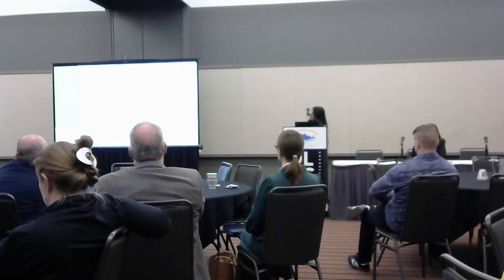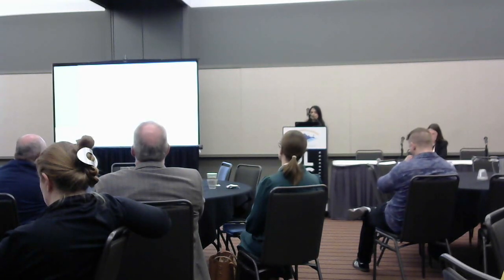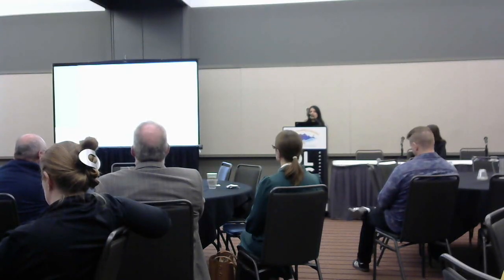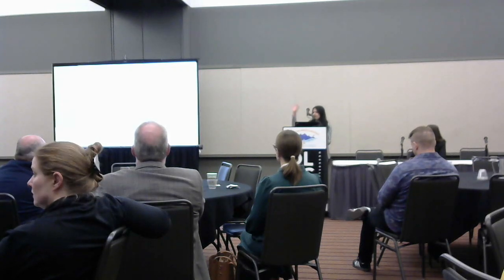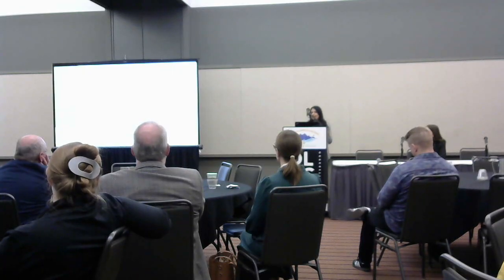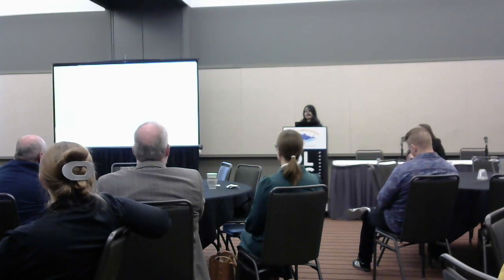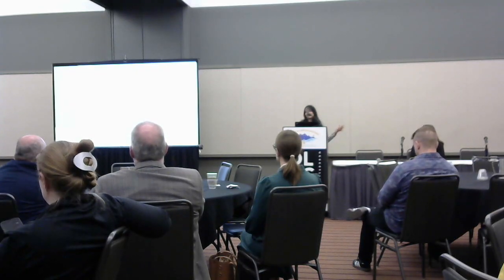And I also wanted to briefly show you what the data workflow in our microscopy core looks like, and where HPC comes in this pipeline. For most of our instruments, from the acquisition PC, our data gets directly transferred to our RSS, the research storage server. We have an active storage tier and then an archive storage tier. The active one is called Helens, named after Mount Helens, an active volcano. And the archive one is Baker, a dormant volcano.